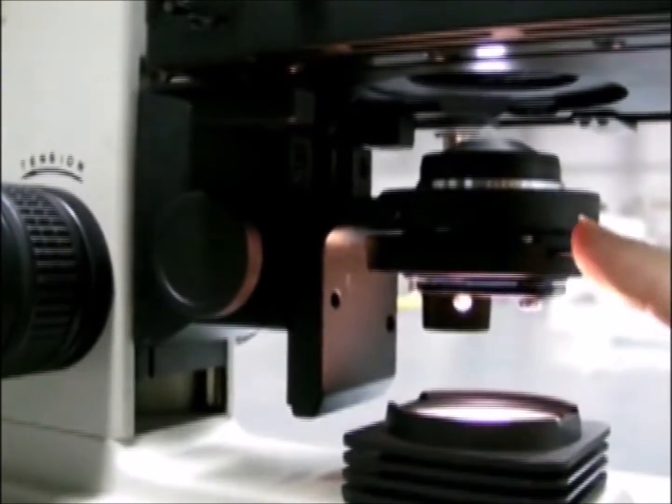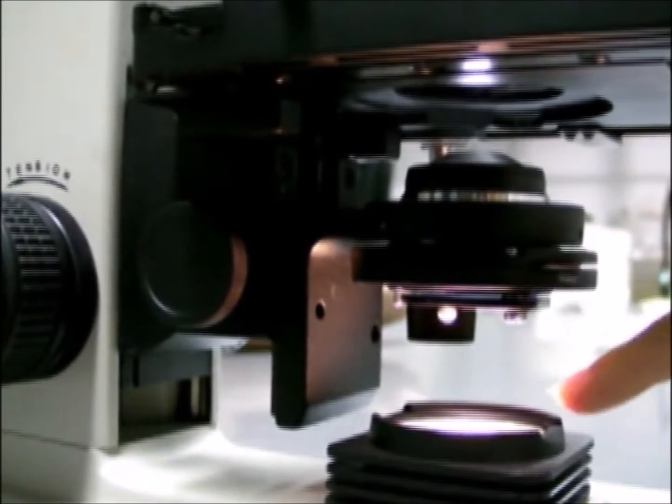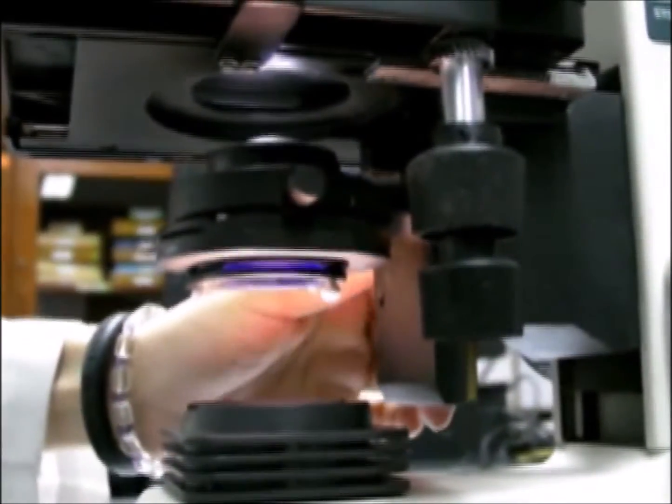This is the condenser. It focuses the light source onto the specimen on the stage. It can be adjusted by turning this knob beside the condenser.